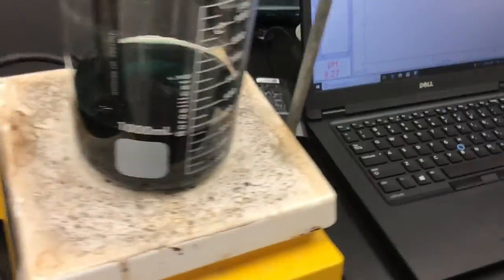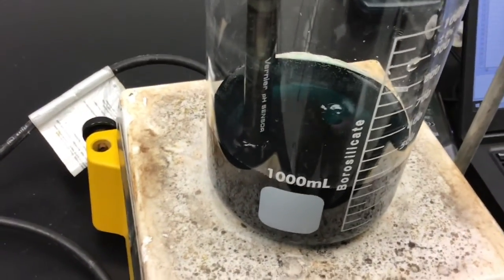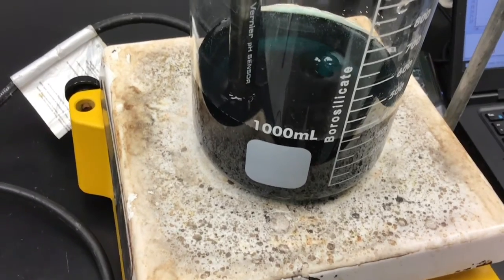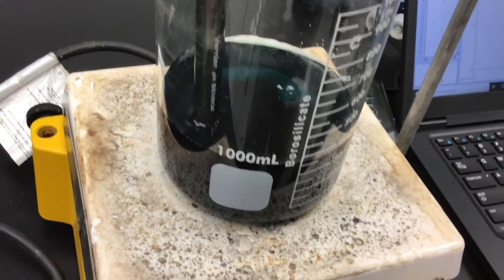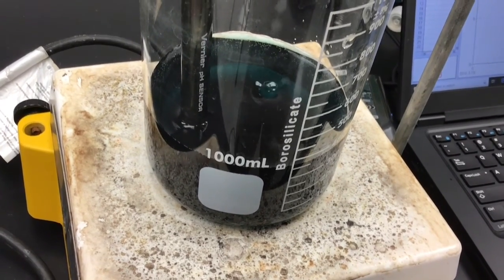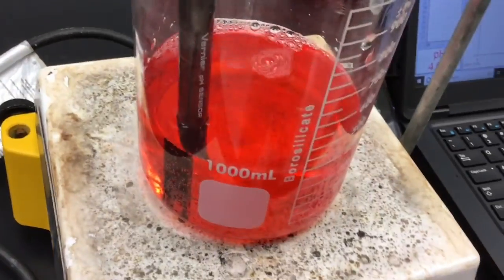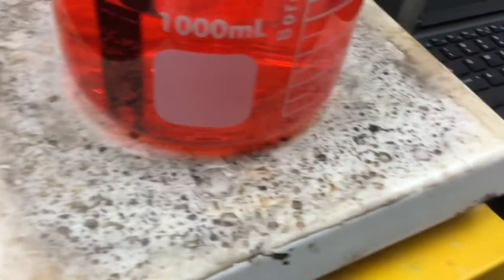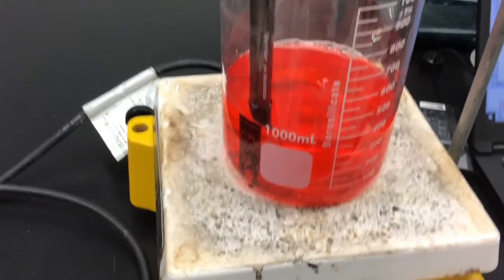All right, so now I'm going to go ahead and put some acid in. I've got some sulfuric acid here. When I put my sulfuric acid in, take a moment and think, what color should this turn? Because again, I'm going to take this to an acidic environment. So my acid goes in, and sure enough, it turns a red color here because of Roy G. Biv, red being the acidic color.